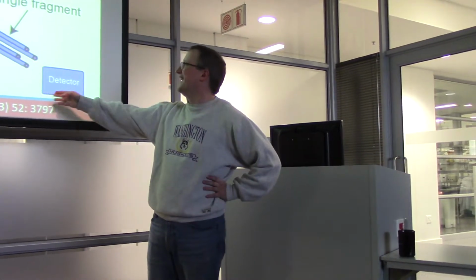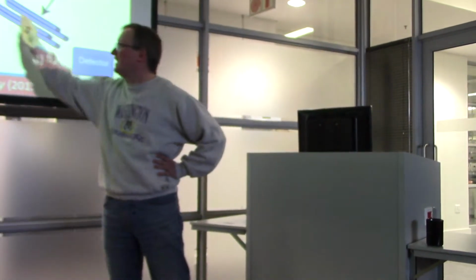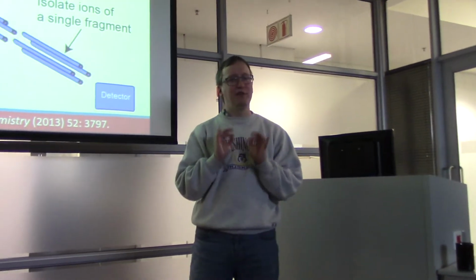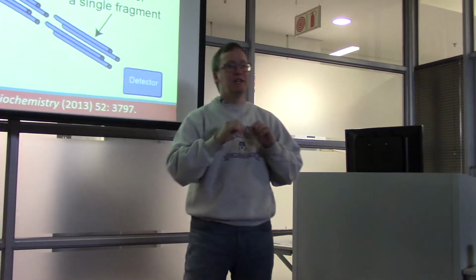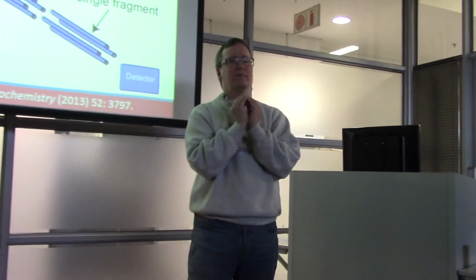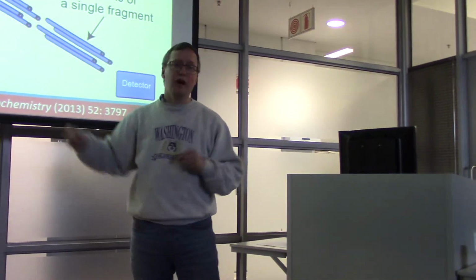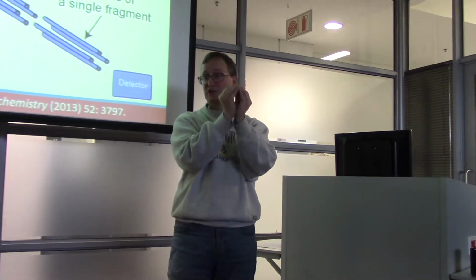Okay, so in this case, the ion source is shown at the upper left, the detector is shown at the bottom right, and the mass analyzer is this complex of 3 quadrupoles. The mass analyzer, in this case, is going to have a different kind of function for each of these quadrupoles. The first one is going to say, I'm interested in getting a signal for this particular peptide's mass to charge value. Okay, so we know what m over z this peptide appears at. And so the Q1, the first quadrupole, is set to pass only ions of that particular mass to charge value.